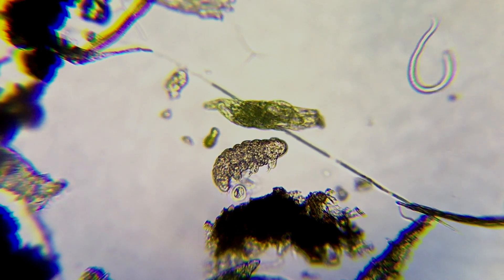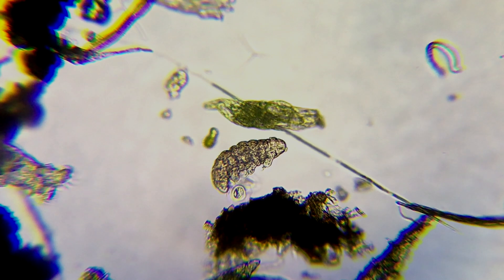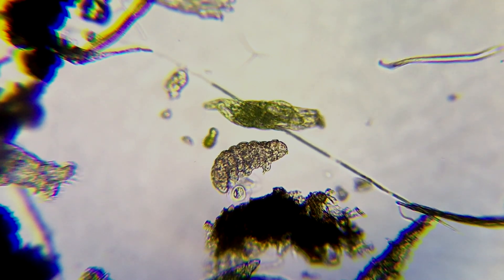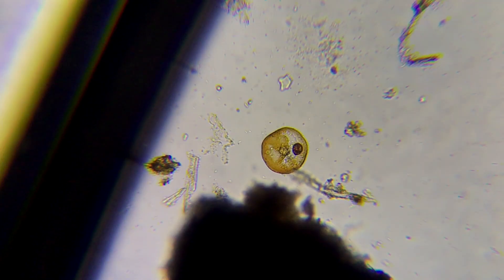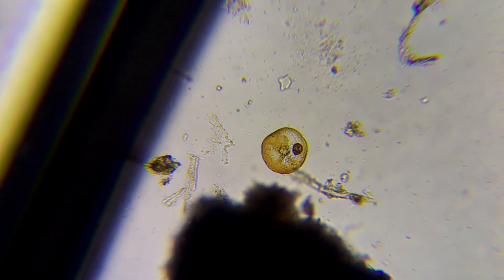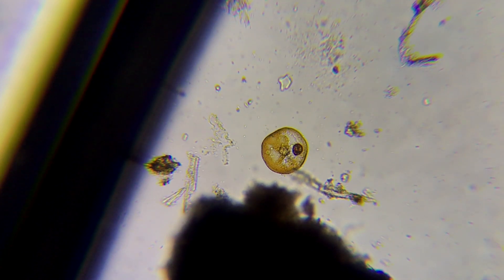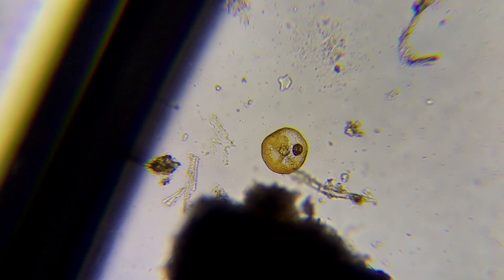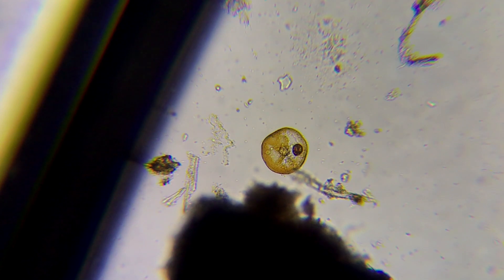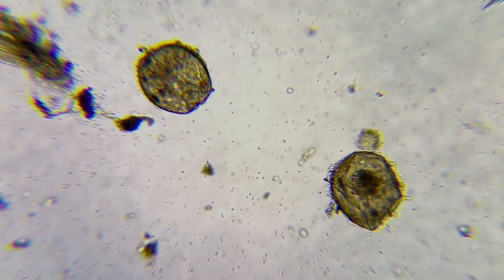Look at how cute the tardigrade is — it's just waving its leg, trying to find something. We found that once it's slow like this, or when we saw it moving fast, it would try to run across the glass but it wouldn't be able to. Here's what we think is a tardigrade in a cyst. The cyst is like a tardigrade that's dead, but also not dead at the same time — it's just how it lives in places that don't have many nutrients, so they turn into a cyst.